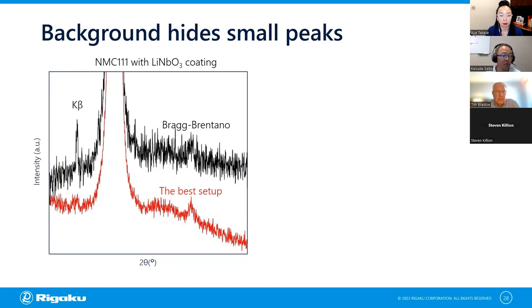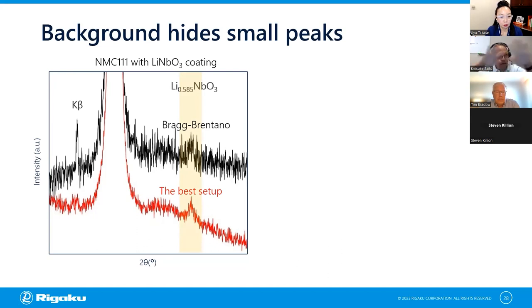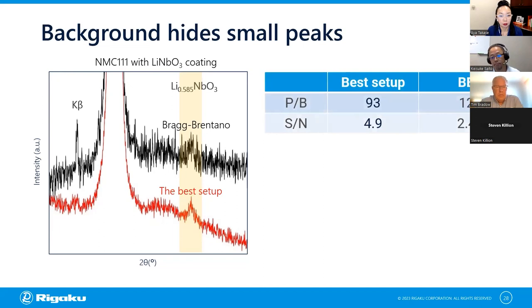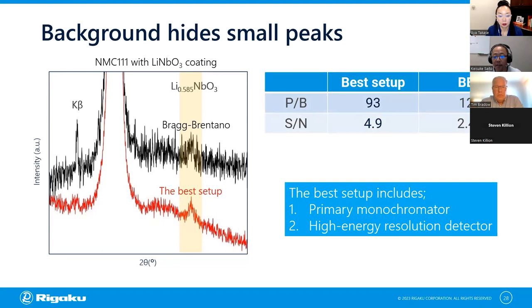Some people say the high background can be suppressed by software — that is true but not enough. The biggest problem is not only the high baseline but that the XRF background hides small peaks. For example, this is NMC 111 with lithium niobate coating, which improves the endurance property of NMC. The lithium niobate peak is actually present, but with a conventional Bragg-Brentano setup — a classic XRD geometry — the high background makes it unclear. The best setup improves the peak-to-background ratio and signal-to-noise ratio using a primary monochromator and high energy resolution detector.